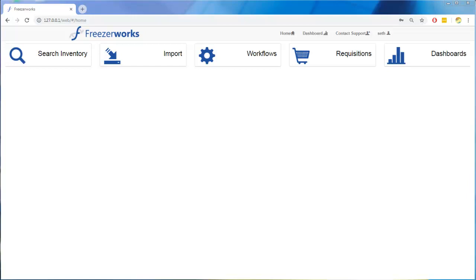Would you like to aggregate and visualize important, big picture data about your lab, clinic, or study in colorful, easy to read charts every time you and others log into the web client? This is the purpose of the new dashboard page.